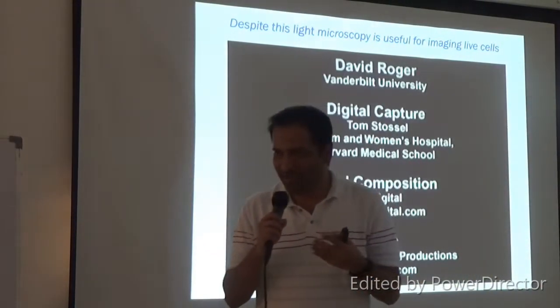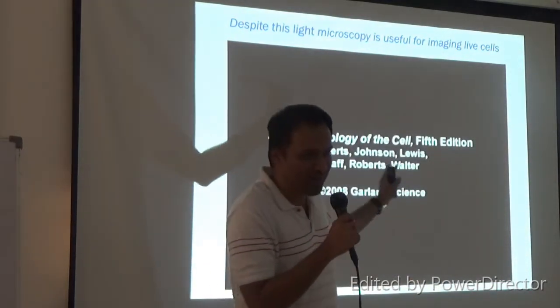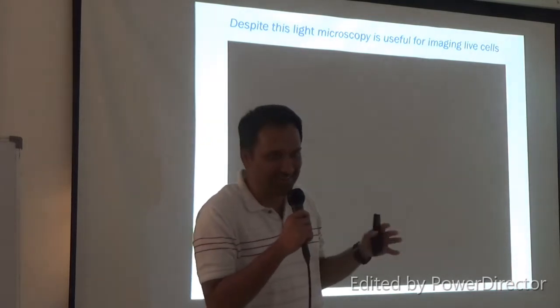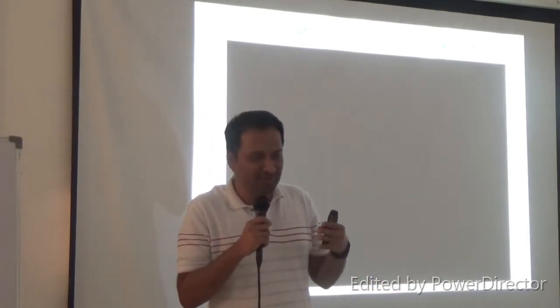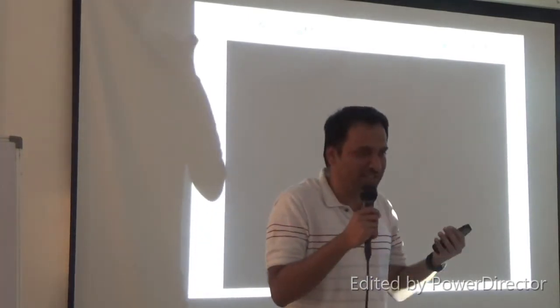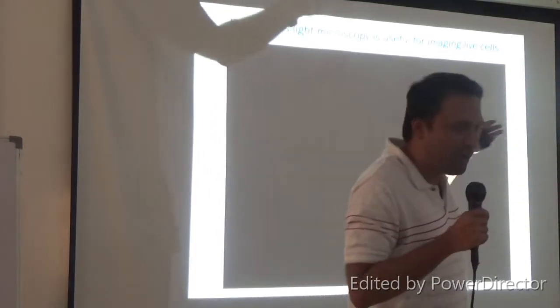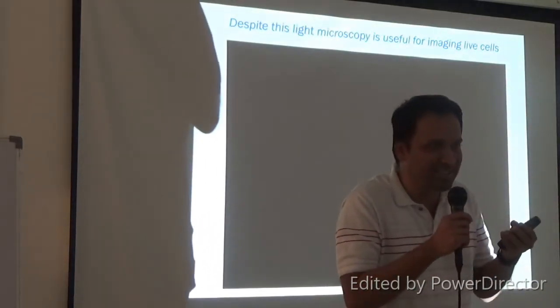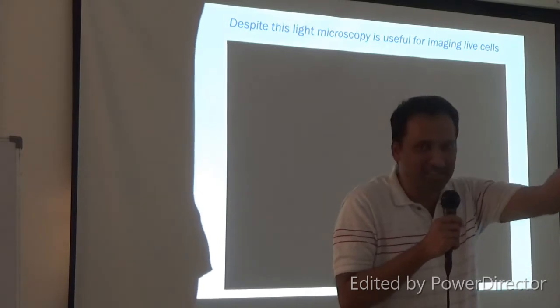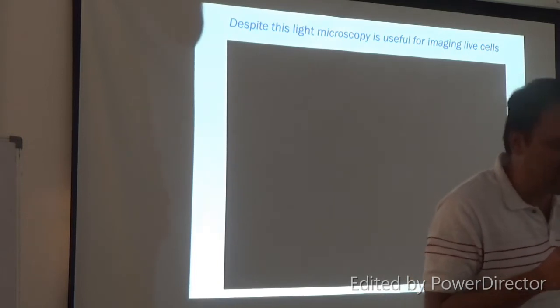We tend to have a little bit of an anthropocentric view of life, right? Neutrophils don't make sound, so don't take the sound too seriously. It's not like they eat bacteria and then they burp. But also the other thing why this is anthropocentric is that it almost seemed like that neutrophil, which is a white blood cell, one of our immune cells, among a pool of red blood cells, is chasing the bacteria. It almost seemed like a sentient being, right? It's like it knows what it is chasing, and then it's going after the bacteria, which is running away, and the neutrophil is chasing after that.